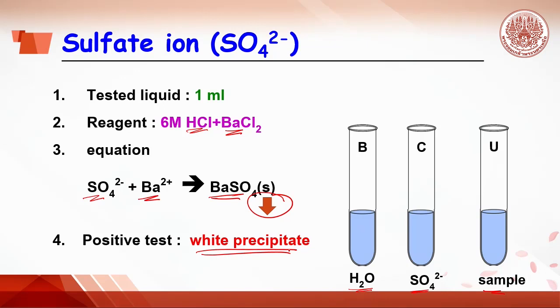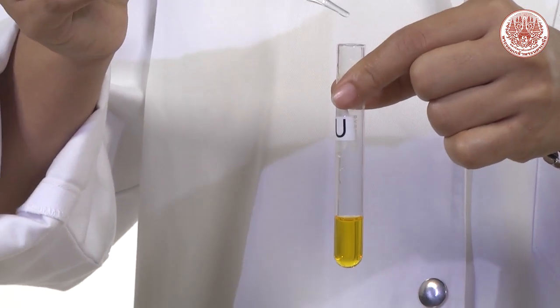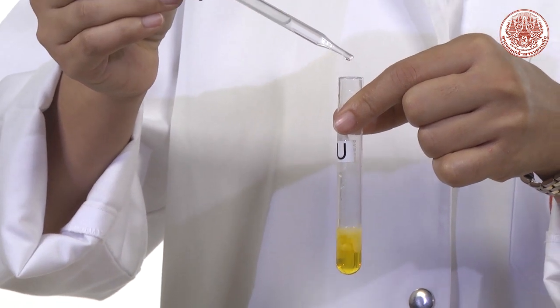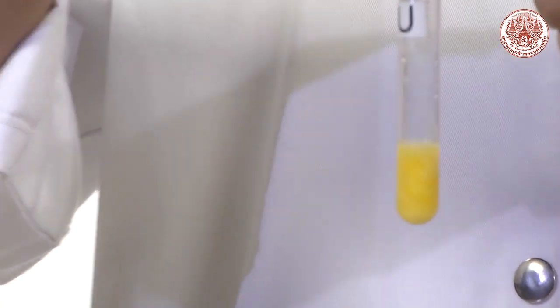The positive test will be white precipitate. Now, look carefully after barium chloride is added into the U tube. If the sample contains sulfate ion, white precipitate will be formed.